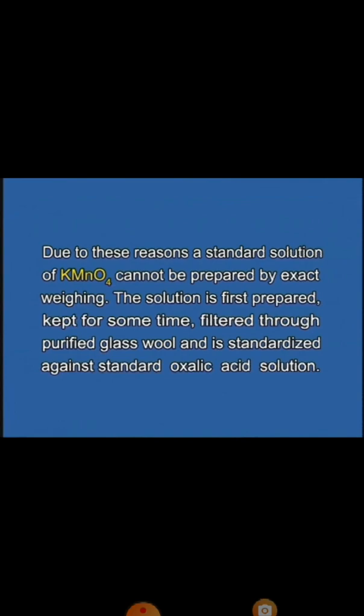The solution is first prepared, kept for some time, filtered through purified glass wool, and is standardized against standard oxalic acid solution.